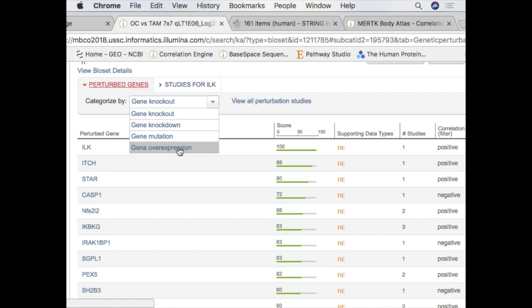That whole speech about reproducibility in academia, it's true. There's probably 100,000 studies in Gene Expression Omnibus. This is where we're sticking all our data. Illumina went through it and found only about 25% that they can use, right? It's a huge deal. So again, you can say whatever you want about your data, but you can't fake 30,000 different things. And if you can, then you probably shouldn't be doing this. You should probably be doing something else, right? I love this because I'm looking at their data and I know exactly what mine's related to without having to trust somebody trying to get a grant saying.